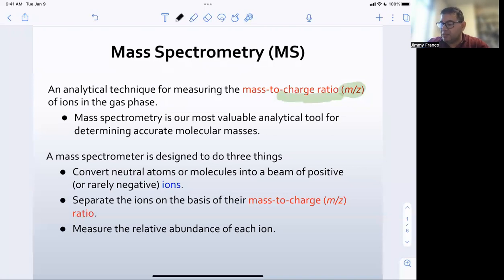All right, so let me give you an example. If you have an amine, so your NH2, you put a little bit of acid. So our H plus is that example of some acid. It becomes NH3 with a positive charge. Now that Z value becomes 1. And so we can see the mass of the molecule. If your charge is 1, that's actually the easiest case because it's exactly that molecule.